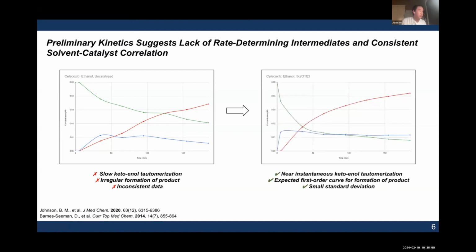In contrast, we have equally numerous triplicates where this process happened at a much quicker speed, and the results were much more reliable, having a low error rate and forming a smooth first-order curve as the reactants were used up and the product concentration increased over time.